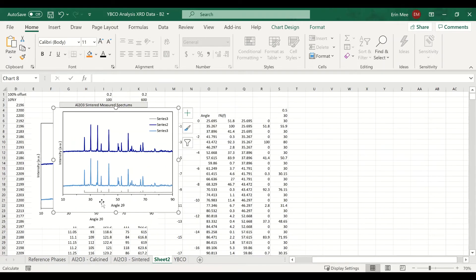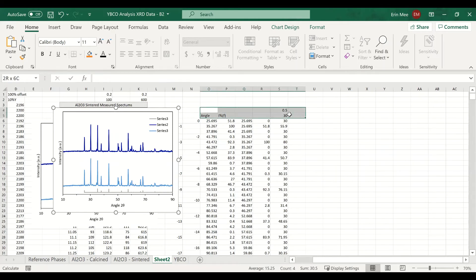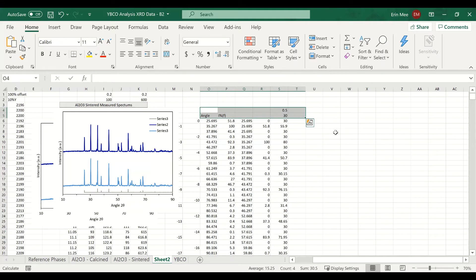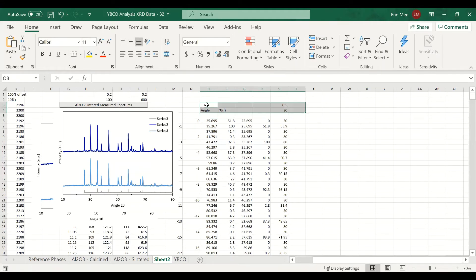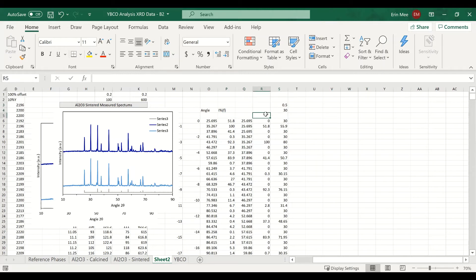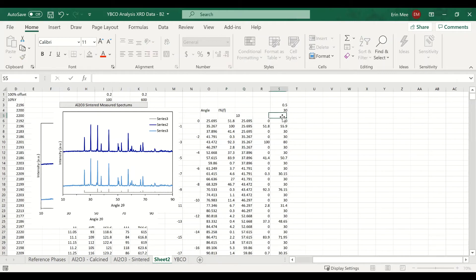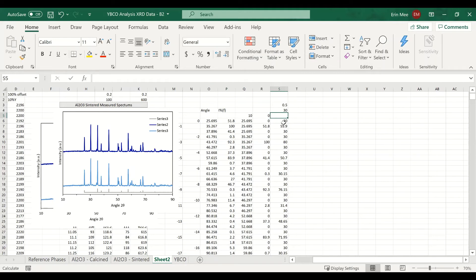I should also add one more value up here — an angle value of 10 and intensity 0 — so that the line continues all the way to the edge of the plot.